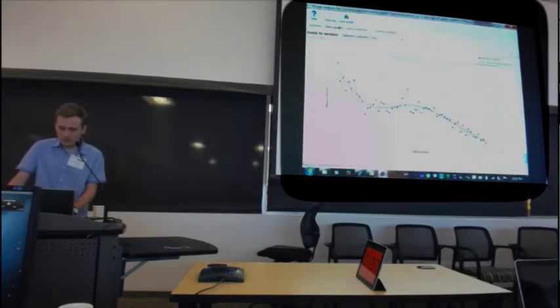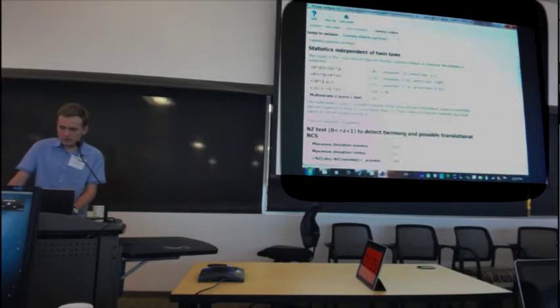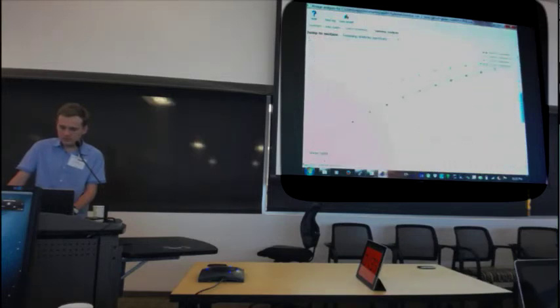And what is also important to look at, what Nick also mentioned yesterday, the NZ statistics. So for FEL data, this plot doesn't always look as good as this one, but you see that it's pretty good.